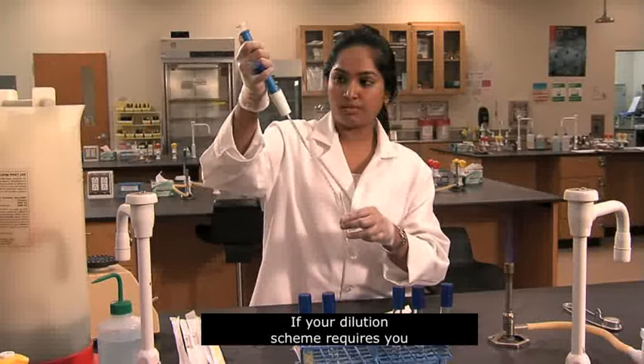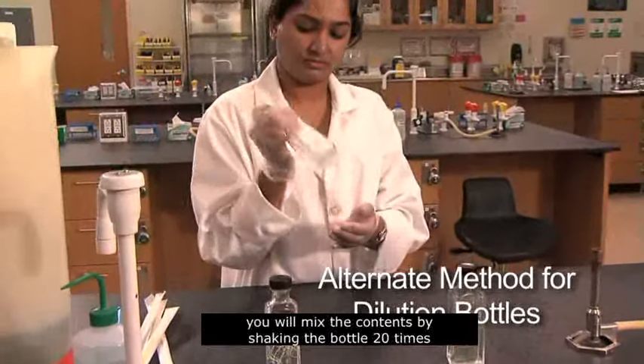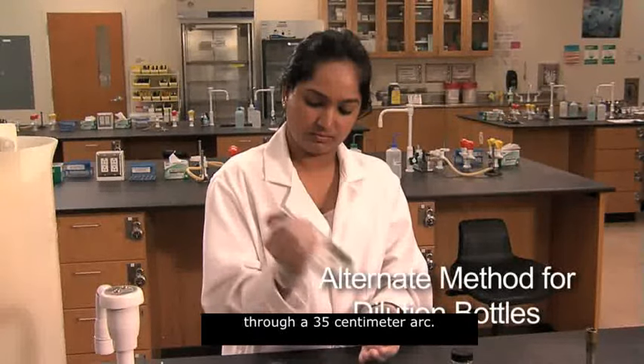If your dilution scheme requires you to use 99 milliliter dilution bottles, you will mix the contents by shaking the bottle 20 times through a 35 centimeter arc.